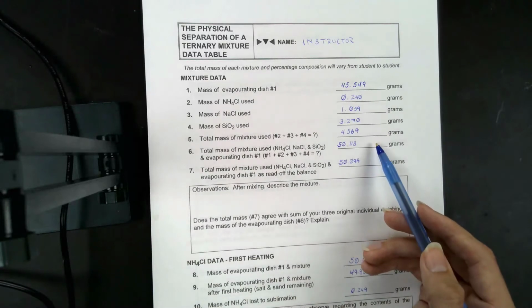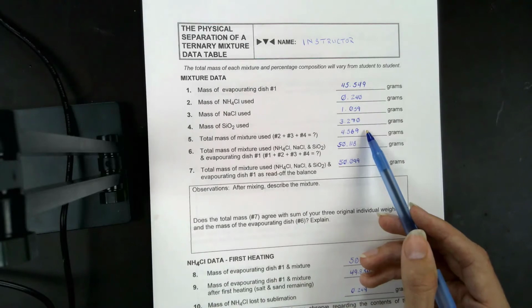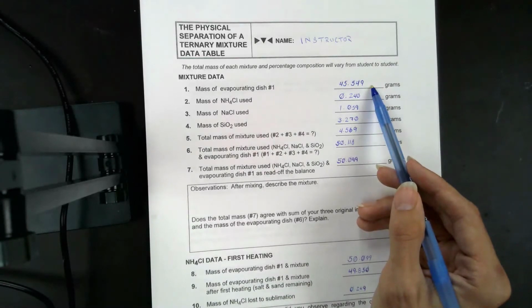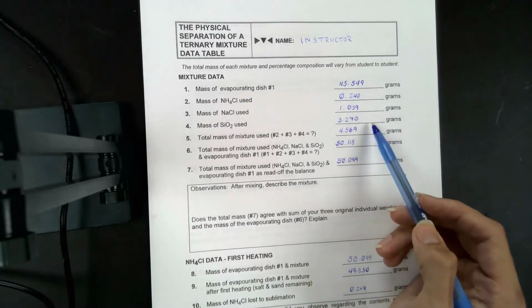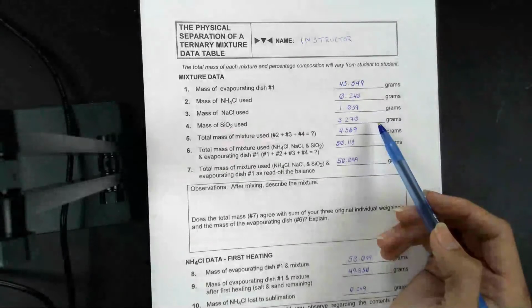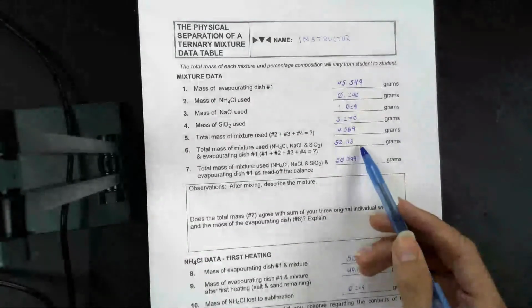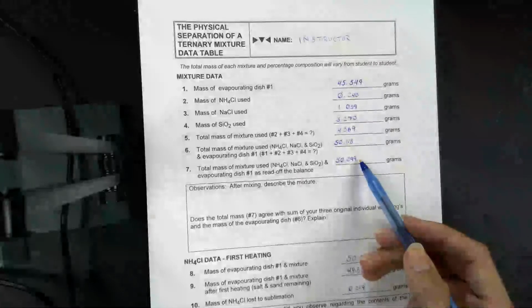Item 6 is I just added this value, my total mass of the mixture, to the mass of the evaporating dish. So item 6 is just item 5 plus item 1. It's the total weight of everything, the mixture as well as the dish that holds it. Item 7 is if I took the evaporating dish with everything in it and weighed it.